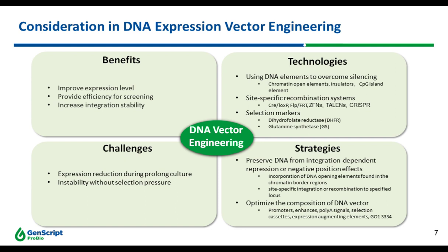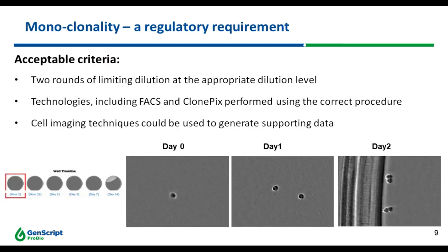They also have a very efficient negative selection of unstable clones, and chips that are relevant to bioreactors. They also use an automatic monoclonal process that can produce a visualized record. The downside is that it is very high cost and not widely available.